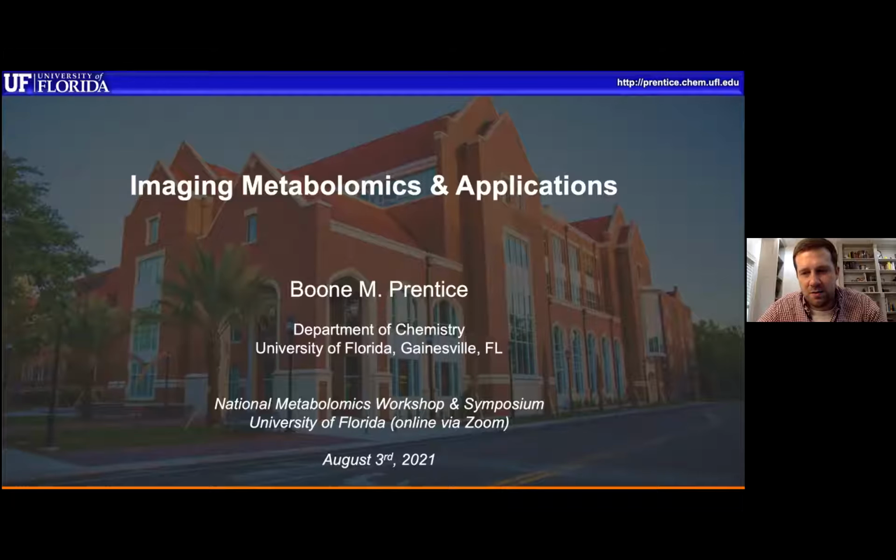I'll also talk about some of the technical aspects of doing the imaging experiment. So I'll try and show a couple of videos and demonstrations of how we prepare samples and run the instrument. I'll also try and highlight some new directions that I think the field is moving in, some exciting avenues of research that our lab and others are pursuing. And then also, as Dr. Chen said, talk about a few applications. I know this is obviously a metabolomics workshop, but in general, this imaging workflow can be applied to a wide variety of analytes and systems. And so I'll highlight here and there some of those aspects.